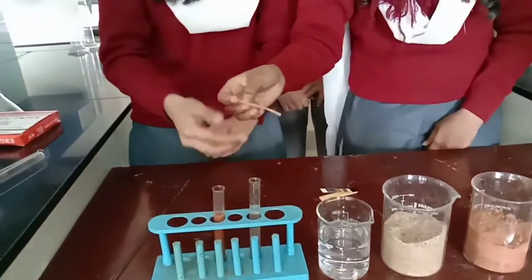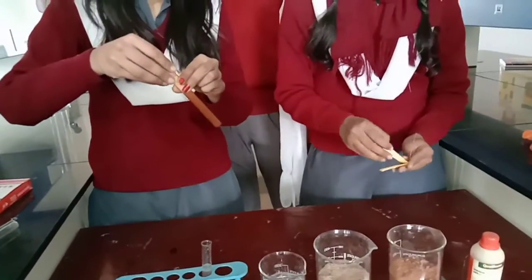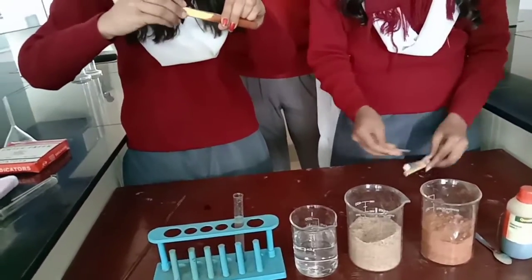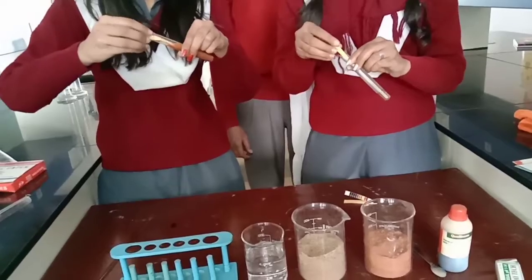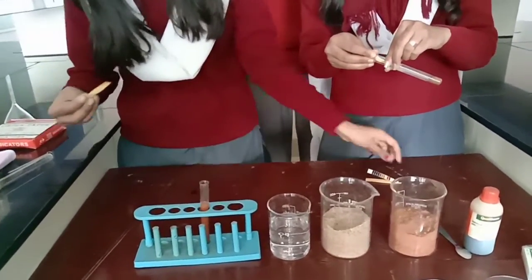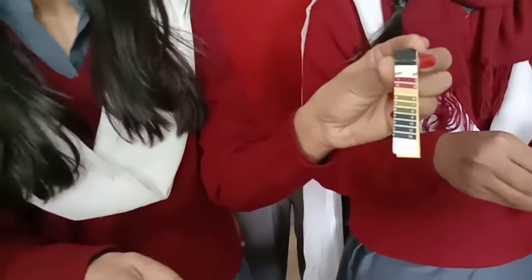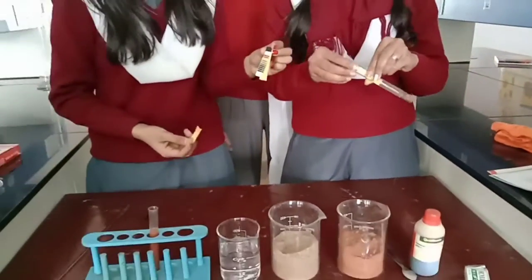We'll take the pH paper. We'll dip a small piece of pH paper in each test tube, in both the test tubes, and after that we'll match the color of the pH paper with the color given on the pH strip or the pH scale.